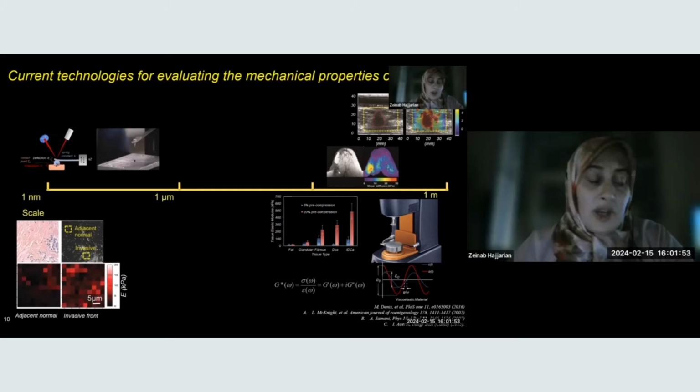On the other side of the spectrum, there are biophysical technologies such as atomic force microscopy that enable sensing mechanical properties at nano and micro scale. But the problem with this technique is that the area search rate is very limited. These types of poking measurements can only be done over infinitesimal areas of only a few hundred microns.